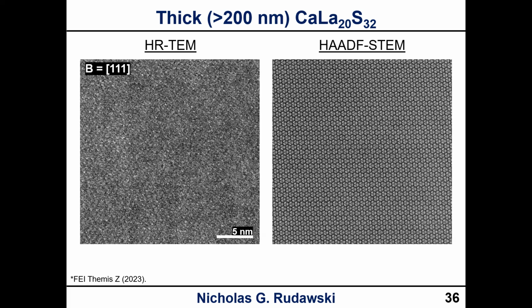Again, I don't know how compositionally different the carbides are, but that would be something to consider. Without knowing more specifics about what you're trying to compare, it's tough to say, but make sure you have an analytical component to go with your imaging and diffraction component.